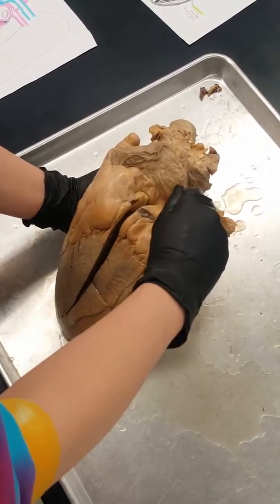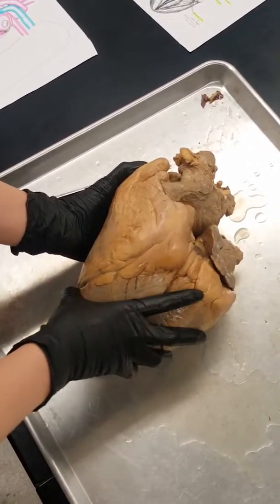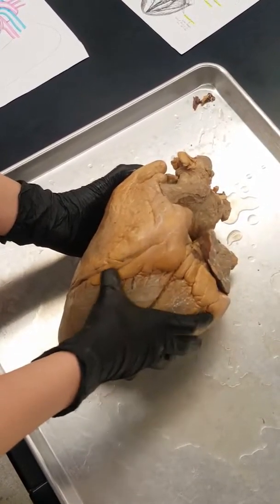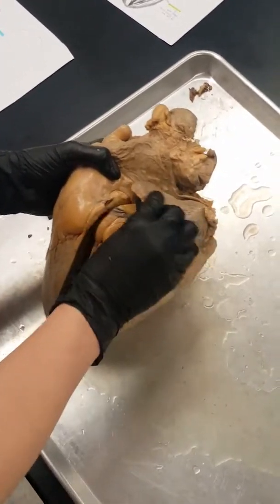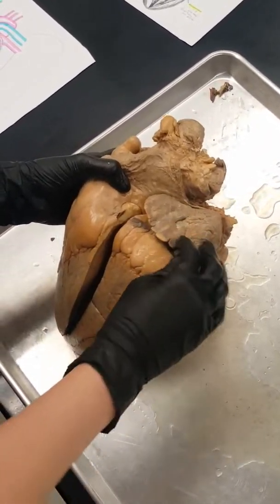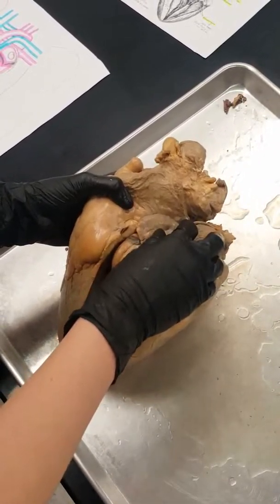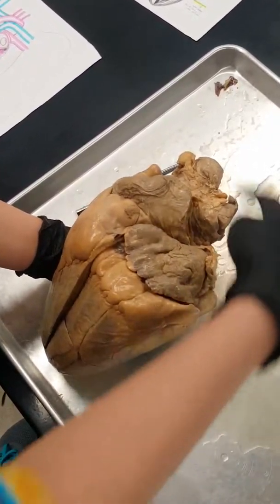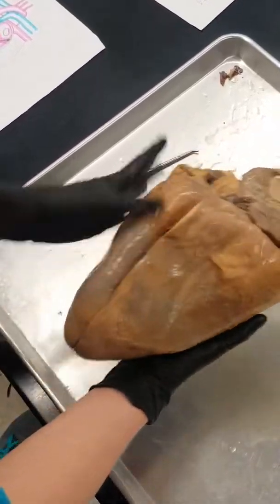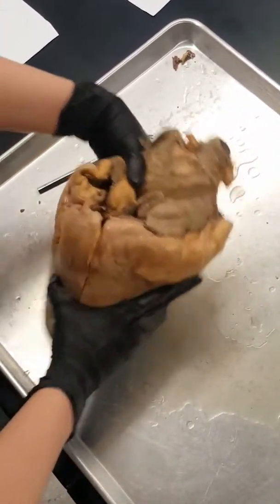This is going to be the outside of the heart as if you were looking at someone else — this is what their heart looks like. You're going to have a little indent here, and that's going to be your interventricular sulcus. Down here, the point is going to be the apex, and up top, generally, this is going to be the base of the heart.